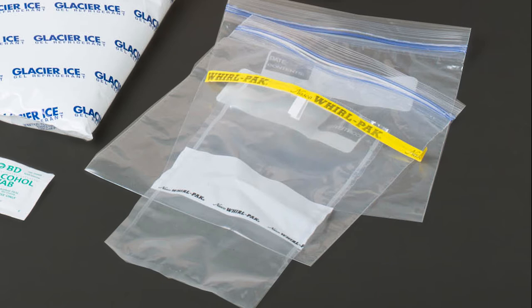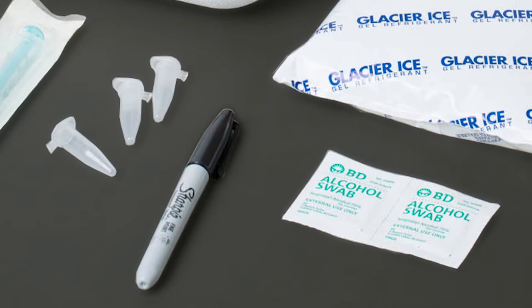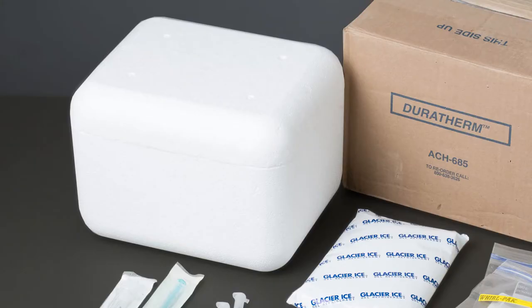Plastic bags can be used to store the blood vial tubes together, and double bagging is recommended. If you're shipping the samples, a sturdy box with shock-absorbing materials such as bubble wrap or paper padding helps protect the samples. Permanent markers can be used for labeling the vials or bags. An insulated cooler with freezer packs can be useful for storing and shipping samples in hot weather.